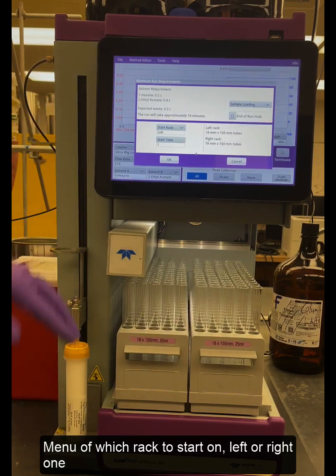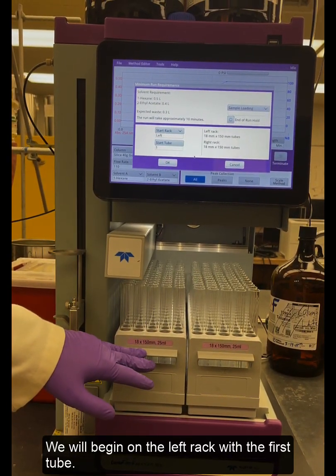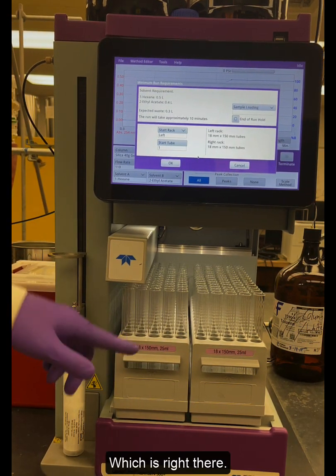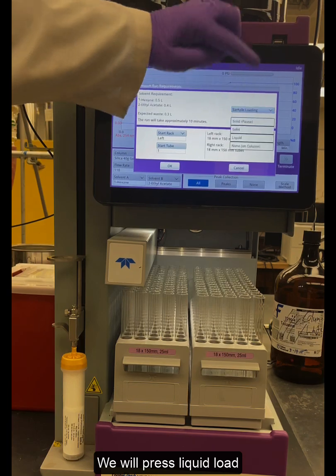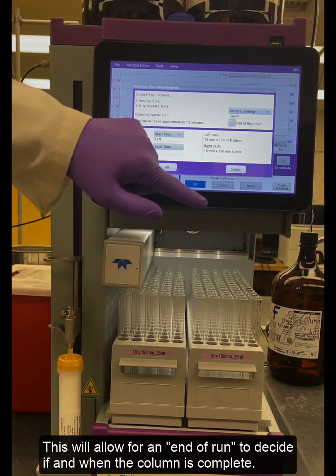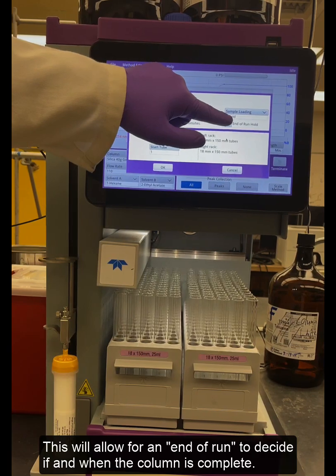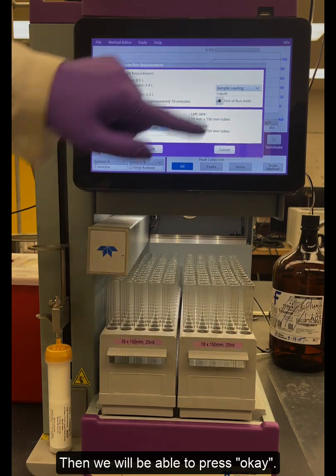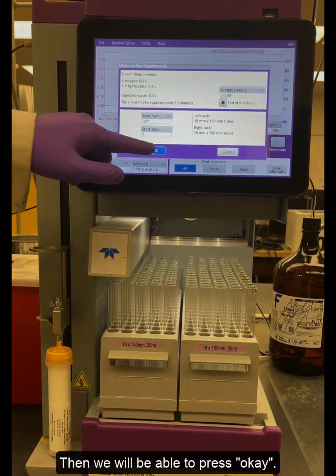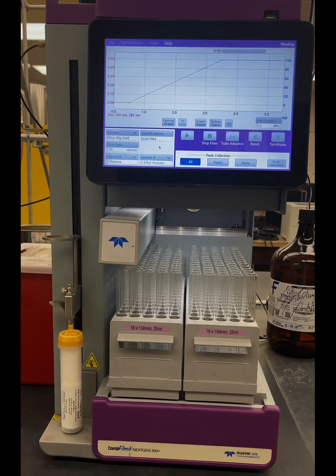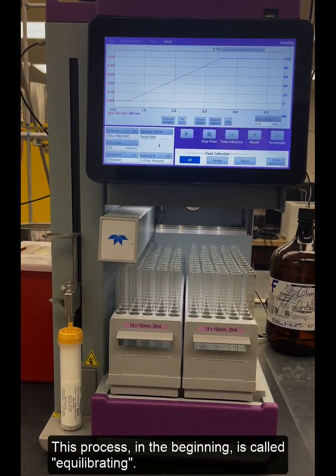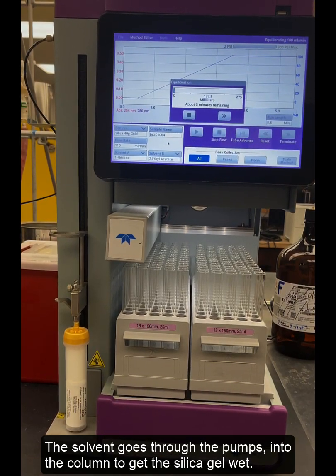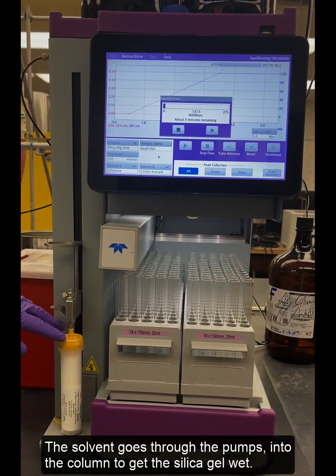Choose which rack to start. We have the left and the right one. We will begin on the left rack on the first tube which is right there. The sample we will press liquid load and allow for an end of run hold to decide if and when the column is complete, and then we will be able to press OK. The process is beginning which is called equilibrating, where the solvent goes through the pumps into the column to get the silica gel wet.